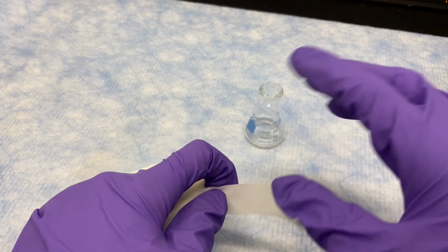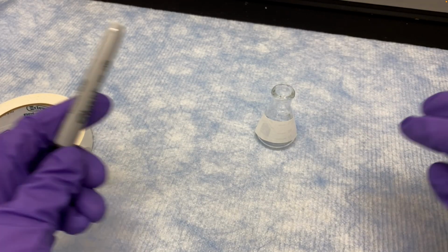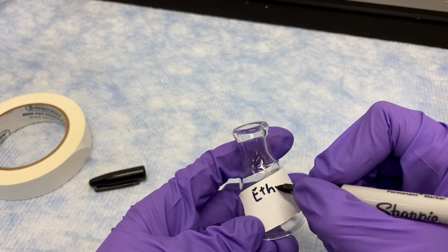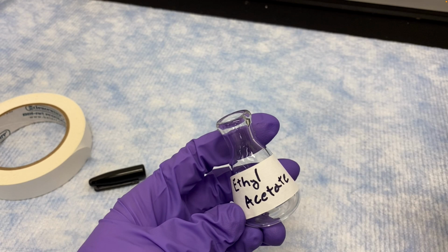There are a lot of clear liquids in the organic chemistry laboratory. They all have different safety considerations. And so anytime you get some clear liquid from the stock fume hood, you want to make sure that you put a piece of tape onto the flask that you're pouring the liquid into, and that you label it. As the different flasks accumulate, all of the clear liquids will start to look the same, and it's very easy to lose track of them and then to expose yourself to something dangerous.